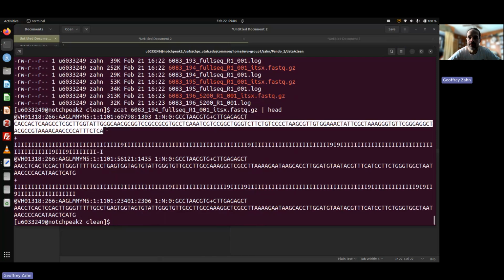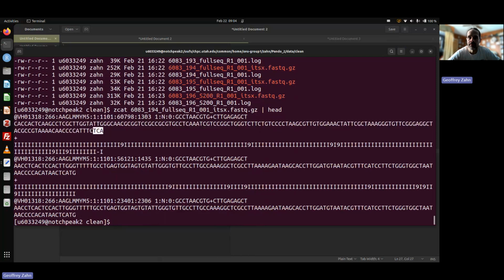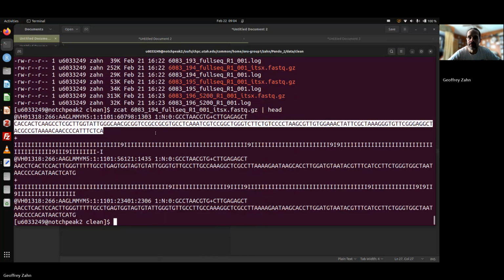And there's a few ways we could proceed. For this study, we're going to use a least common ancestor algorithm, but I want to show you BLAST. So if we take this sequence right here and blast it up against some database, I want it to return the best match so we can tell what this sequence came from.